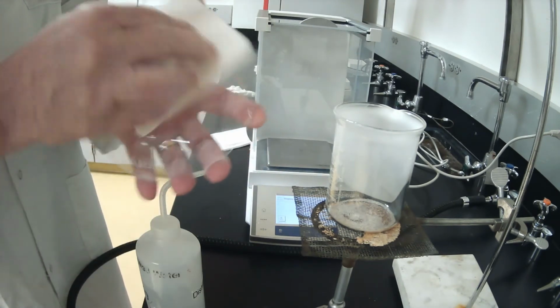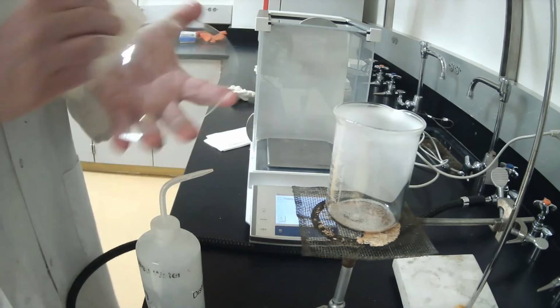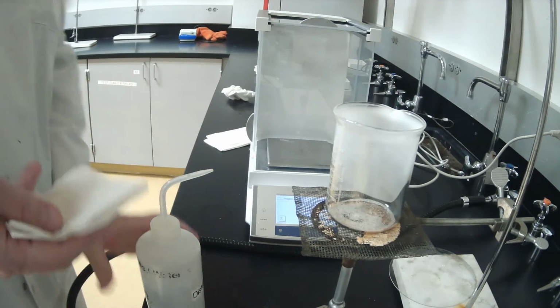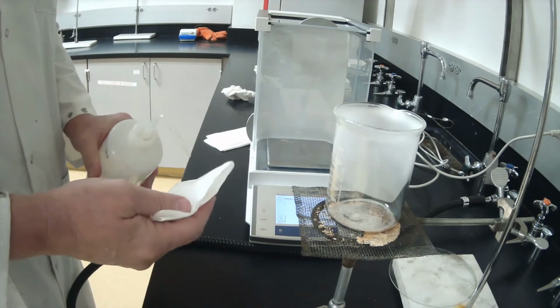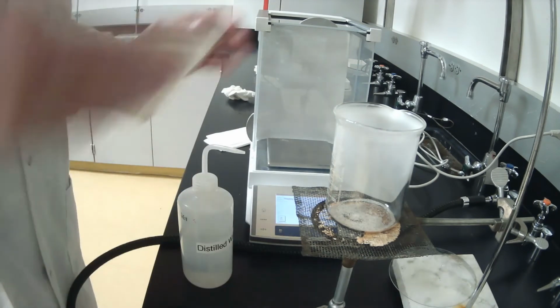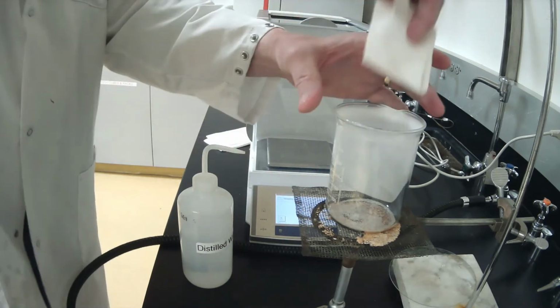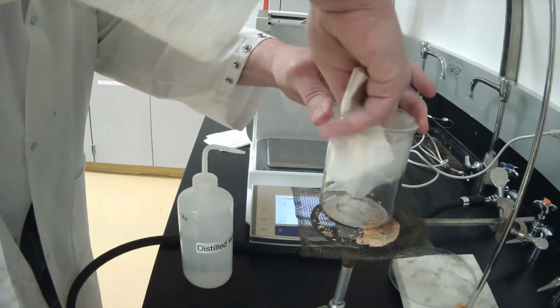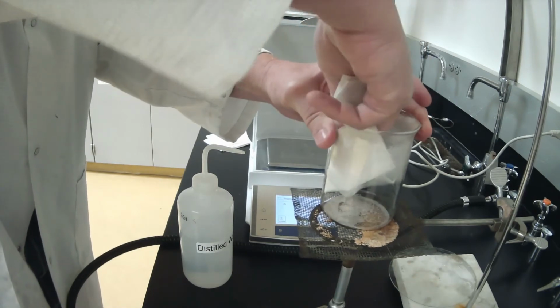See how nicely that dissolves off? So we're going to do the same thing inside the beaker, and we're going to avoid touching the bottom of the beaker. That's why we have the 1-inch gap. So I'm going to lower it down, and I'm going to slowly wipe off the ammonium chloride.